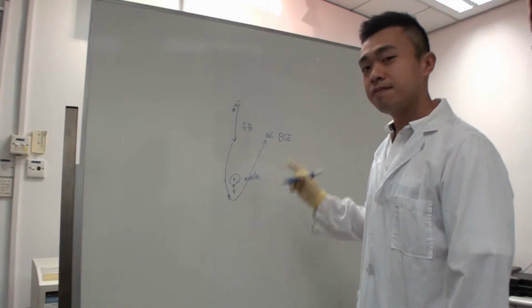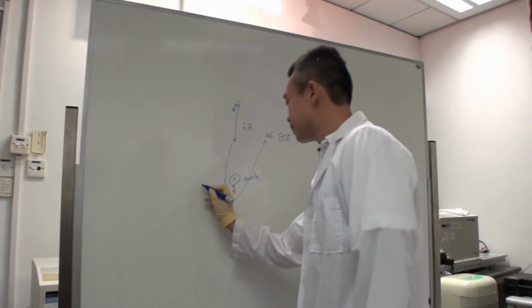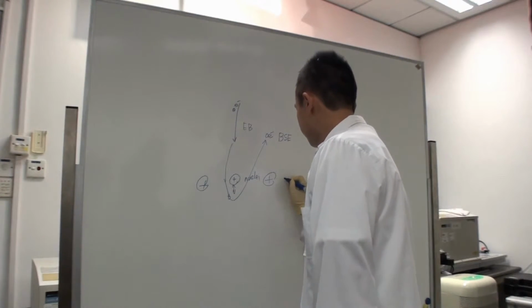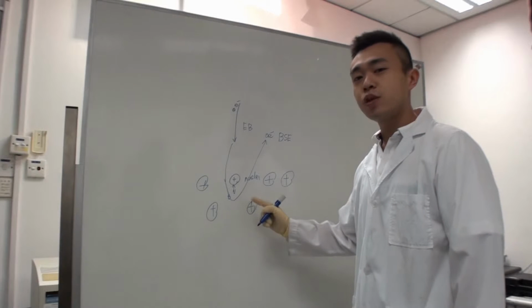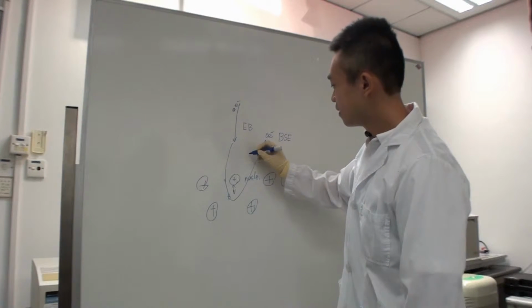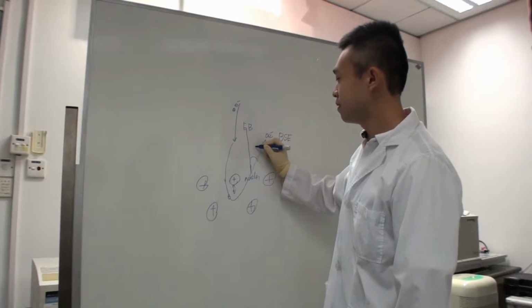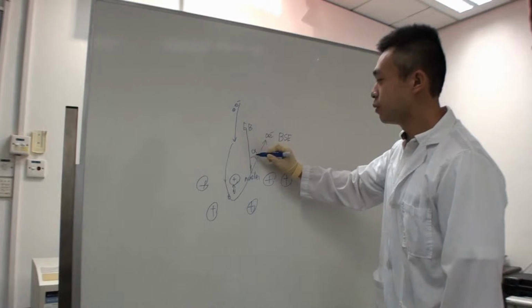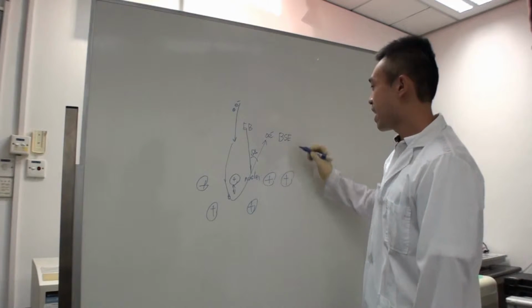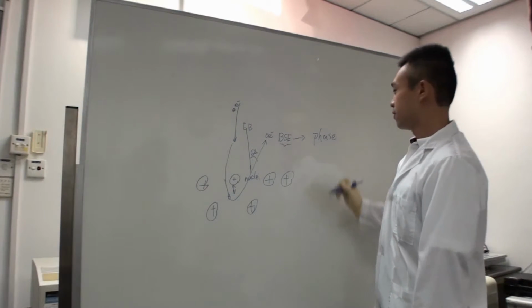Because different materials or different phases have different arrangements of atoms, this arrangement will make the scattering angle a certain one for each material. So we can use this property to detect different phases of material. Finally, let's talk about X-ray.